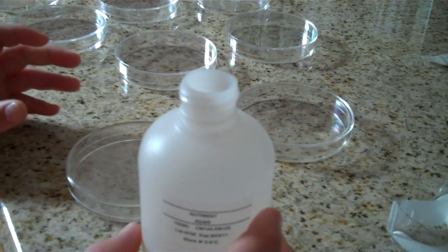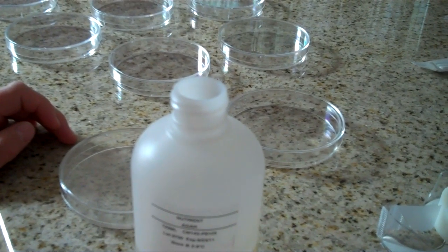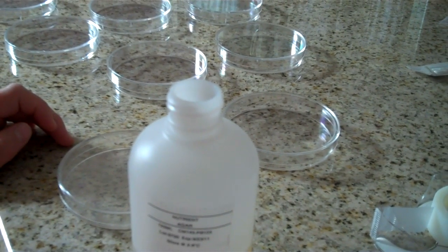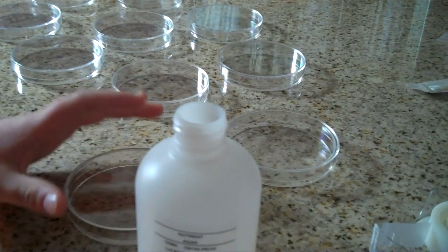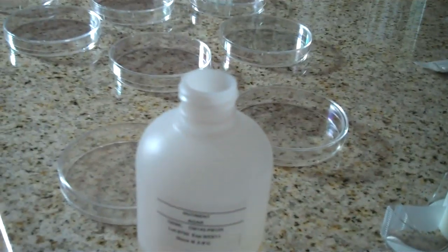Cover the dish immediately to prevent contamination, and tilt it back and forth gently to cover the surface of the bottom of the petri dish.